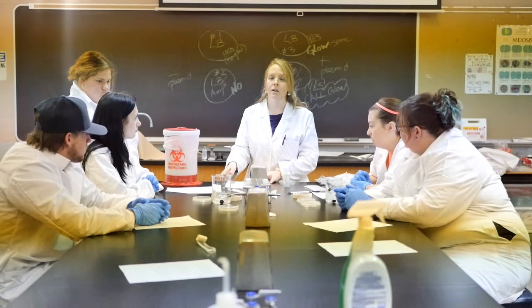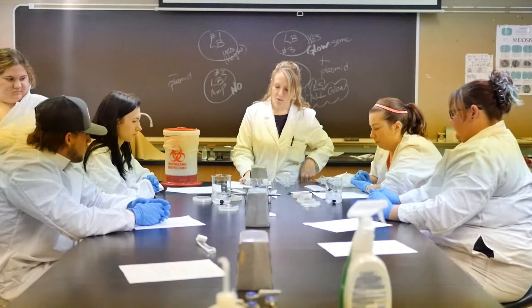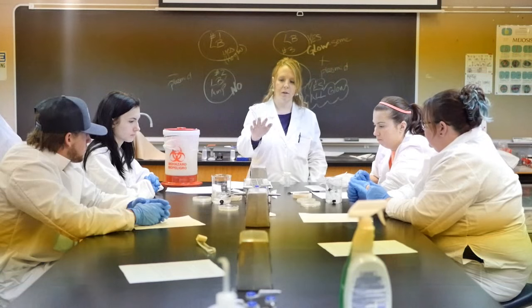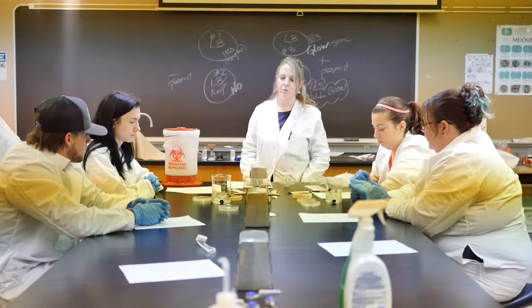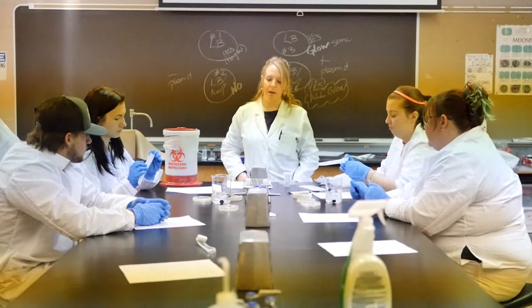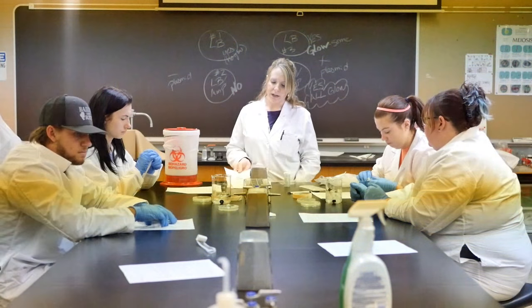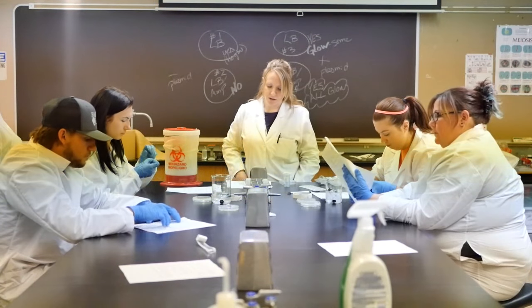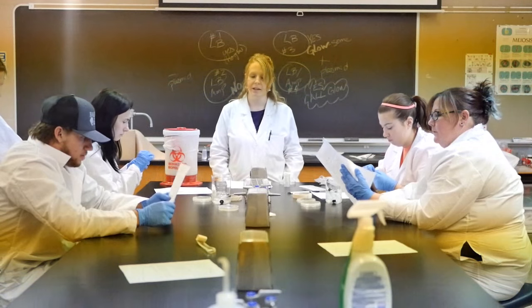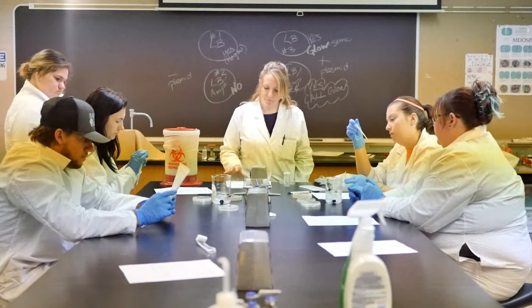So we are done with our room temperature incubation. At this point, we're going to measure out 100 microliters of the cells from the room temperature incubated tubes with your bacteria, with the plasmid and without the plasmid. If you go back to the little diagram on the front page, it shows you where to measure that. It's the mark underneath the mark that you were using last time. It's half the amount that you were using last time, less than that.